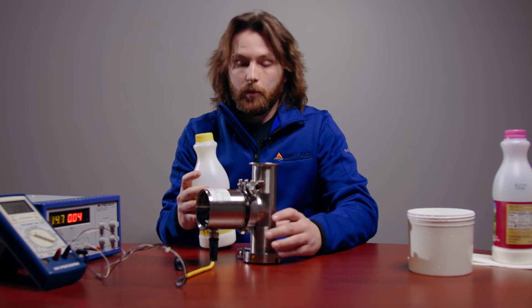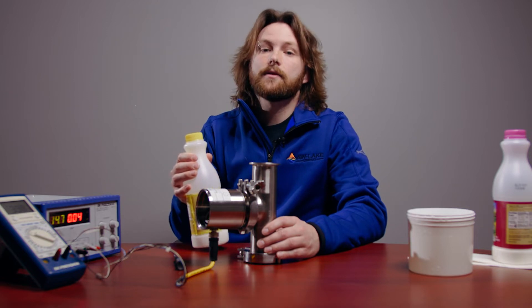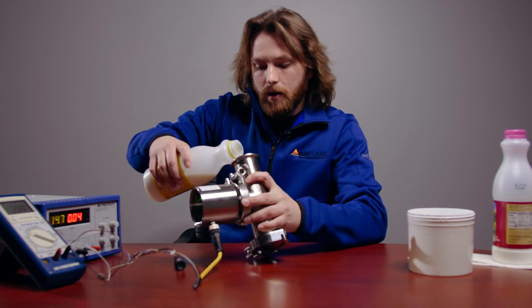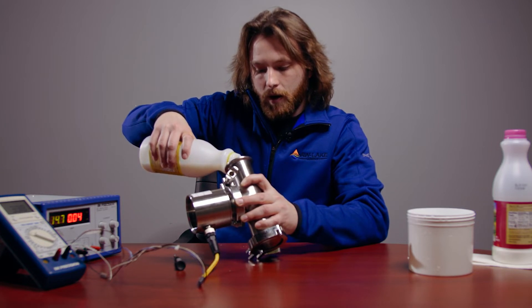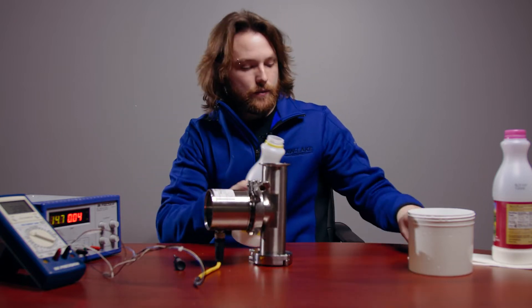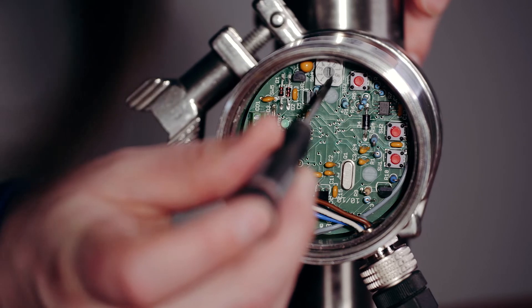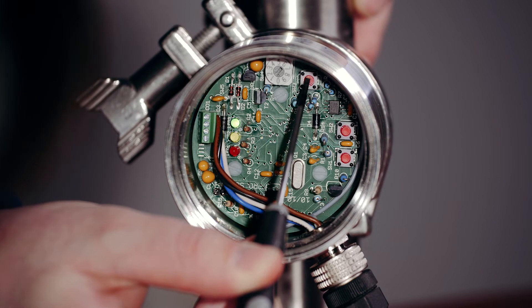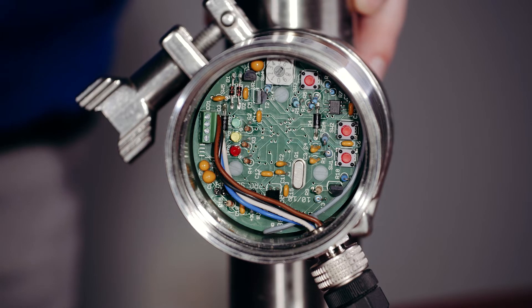In order to get a good calibration, you want to go in ascending order from materials that contain the least amount of milk fat to those that contain the most. My second sample is going to be 1% milk. Pour slowly so that no air bubbles are in front of the sensor. Now turn the switch to position one, and again press and hold the enter button until the yellow LED flashes twice. And that'll be your second point.